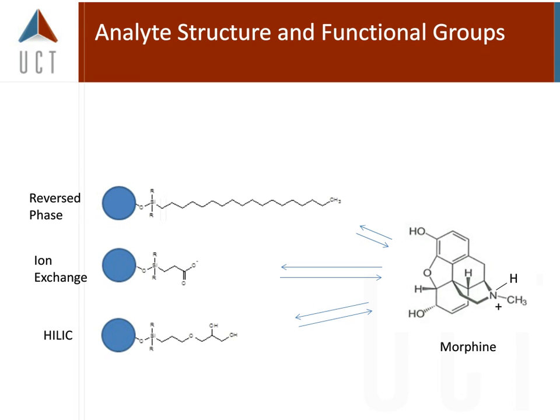When we think of reverse phase, we think of something that's nonpolar. There's not much charge associated with that. The depiction there is a C18 molecule, where it's reverse phase on the top. It sort of looks like a long piece of grass. And when you think of these being attached to either an LC column or a solid phase column, they are sort of like kelp beds that wag back and forth.